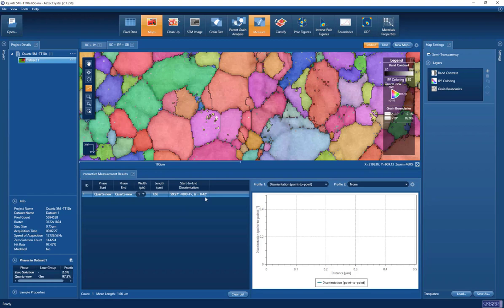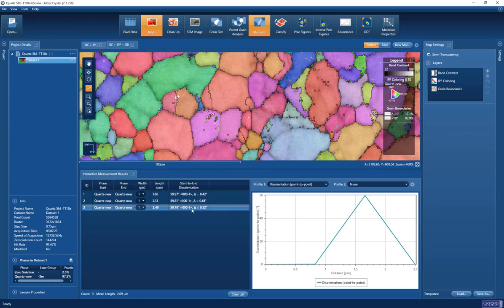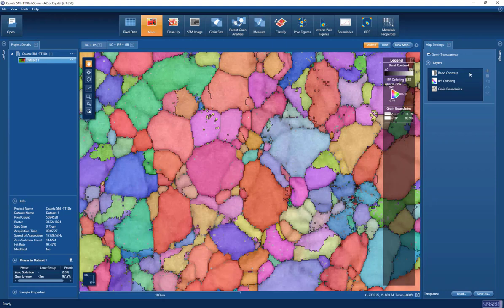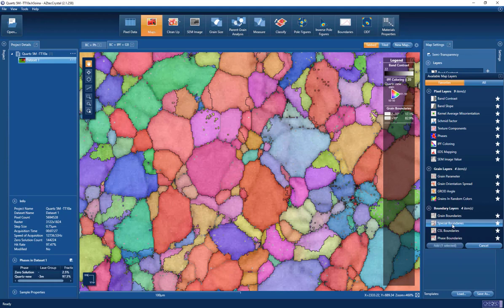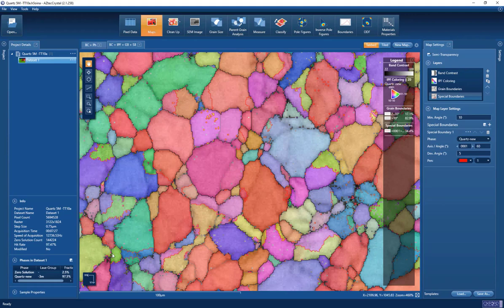We can take that orientation relationship and add it into our data cleanup library. We can also see other boundaries with this relationship — here's another one in the orange grain. So there's a complication: we have twin boundaries with this 60-degrees-around-C-axis orientation relationship, but we also have misindexing. When we plot those boundaries onto the map and color them red, many grains have twin boundaries, but some also have misindexing, such as in the purple grain we looked at earlier.